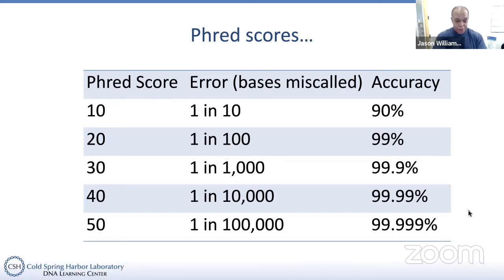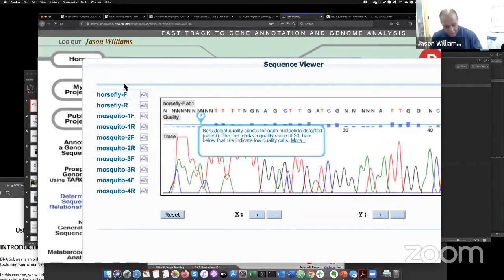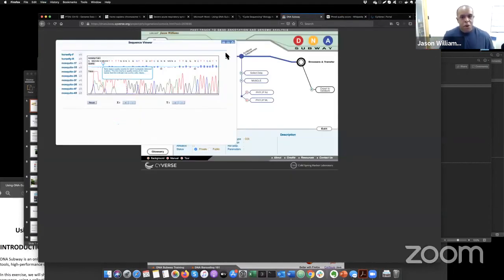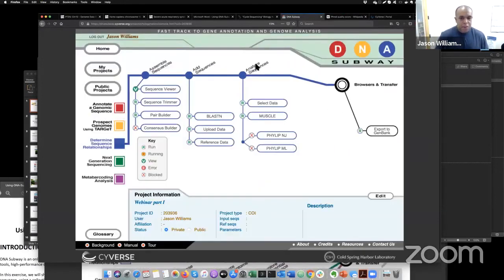And if you do some math, which will be an exercise that I won't do with you, but I encourage you to take a look at those worksheets, you'll be able to figure out what type of Phred scores you really, really want to look at for being able to get high quality data that you use in an experiment. So where we should be at right now and what we're going to be doing the next time is a little bit of homework, and it will prompt you and give you some questions to look at. So when we come back next time, we'll continue with the experiment.